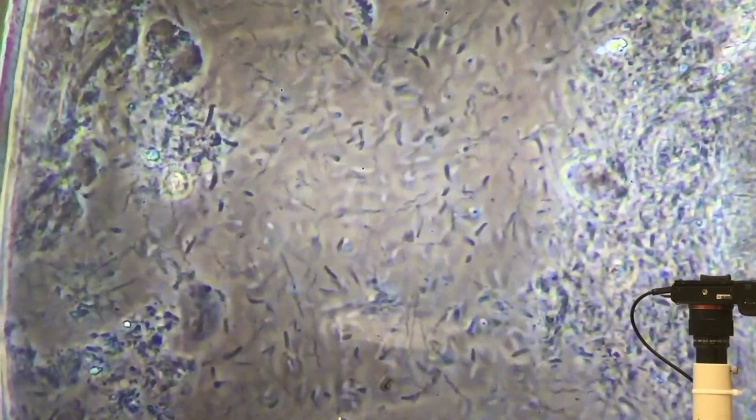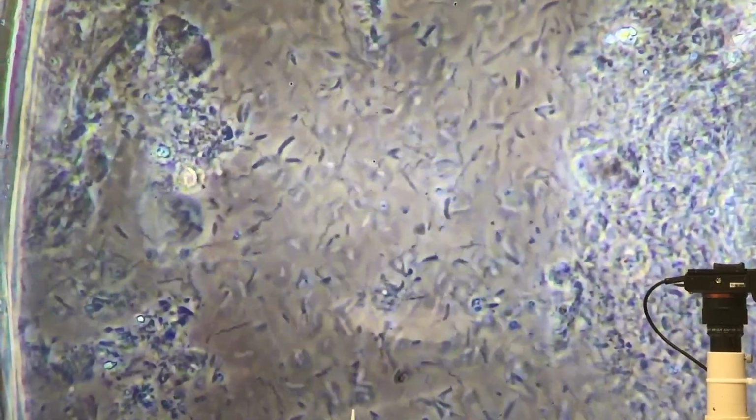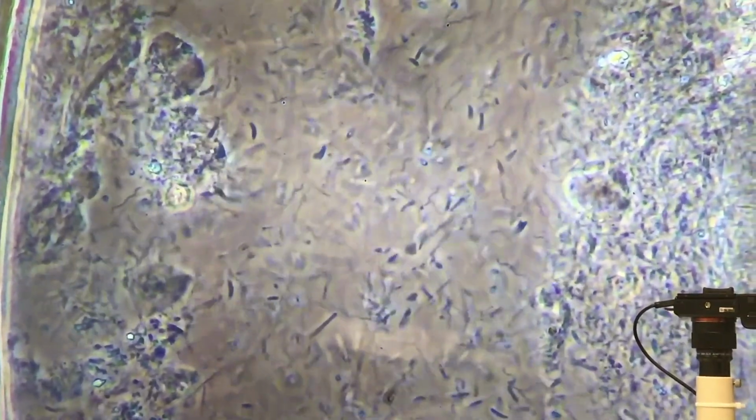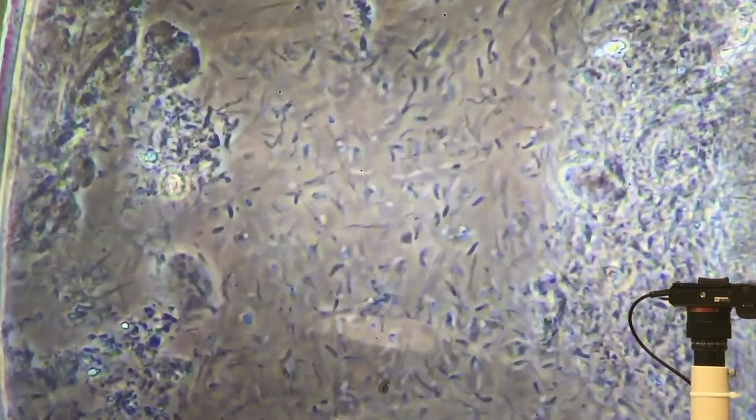That's a trichomonad, that little thing crawling around looks like a mouse, and lots of spinning rods and gliding rods, and there's an amoeba in the upper left. So these patients come in. Now some of them aren't as bad as this, and some of them are worse. These patients come, they have no pain. "I don't know why I'm here, doctor. My doctor sent me here." When I show them this, their eyes open really widely, and they say, get this stuff out of my mouth.